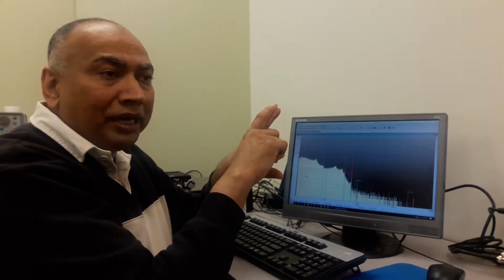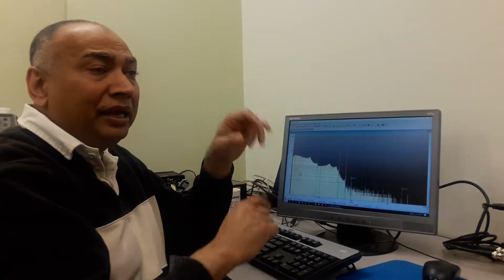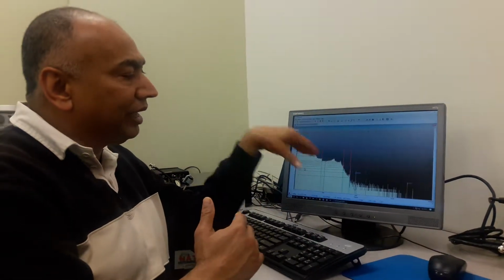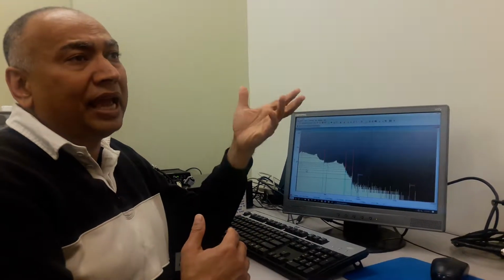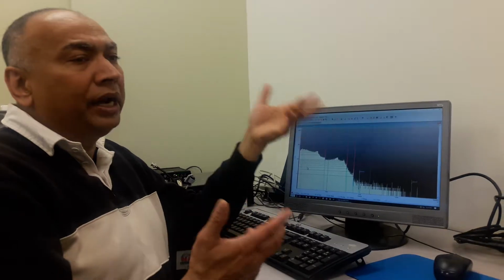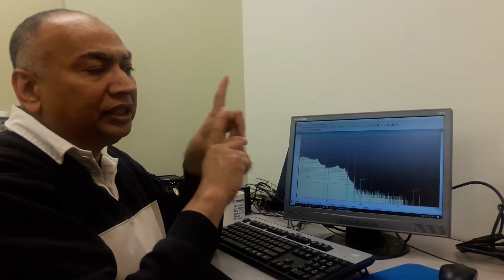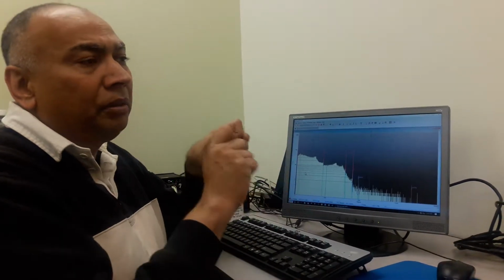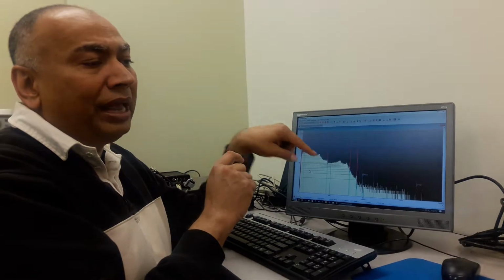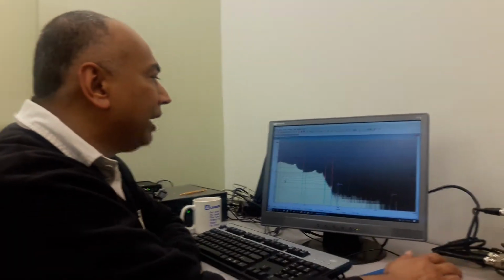If you have a doublet or a triplet in one location and your peak is showing up as a single peak, it's a problem when you have many radionuclides. That is abnormal in our case in environmental counting, but it can happen in the case of, let's say, looking at fluid coolant water where you have many short half-life radionuclides. In that case, the shape calibration becomes very important because you need to know the approximate width of the peak for your detector at specific energies. This is the reason we do the shape calibration.